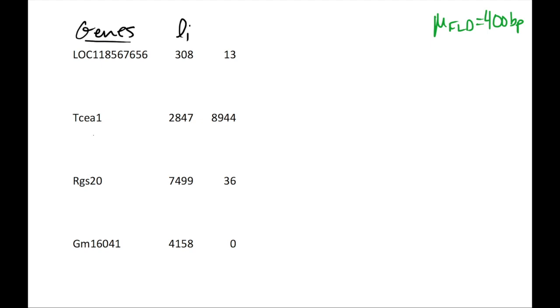This third column is the count. The fourth column, or the invisible fourth column, that will be the effective length. Then there'll be the ratio between the length of a gene and the effective length of its gene. And then finally, we'll calculate the effective counts. I'll catch you on the other side of all that calculating. We'll make a couple of observations then.